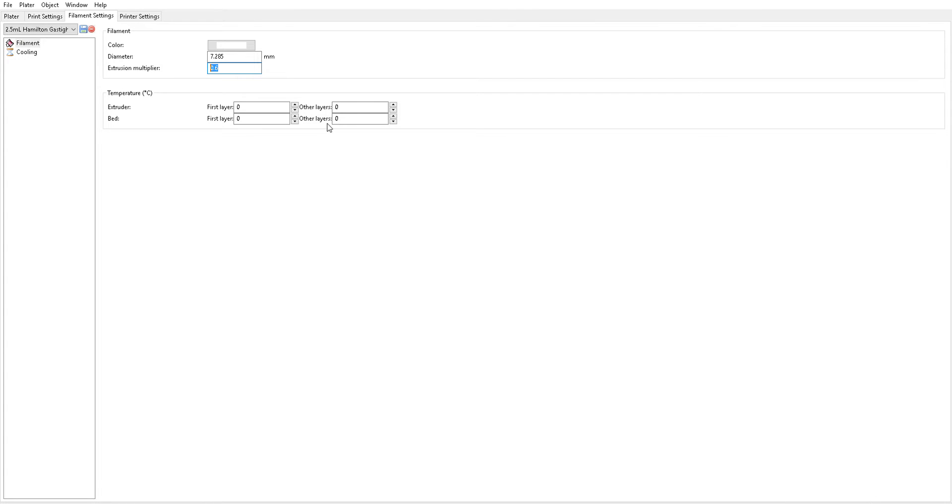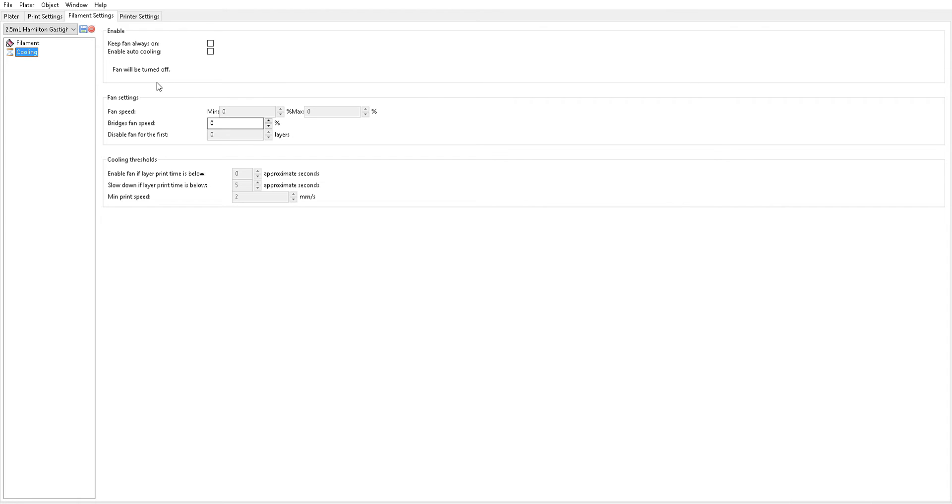Temperatures. Remember that you aren't heating up a filament or a build platform anymore. You don't have to worry about bed adhesion or anything with temperature really. If anything you want to avoid temperature because it can liquefy your support material if you're using gelatin. So keep all this down at zero and it's totally okay. Don't think that your printer's going to freak out.